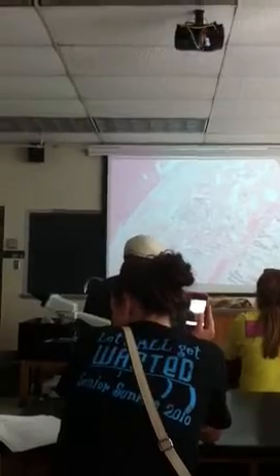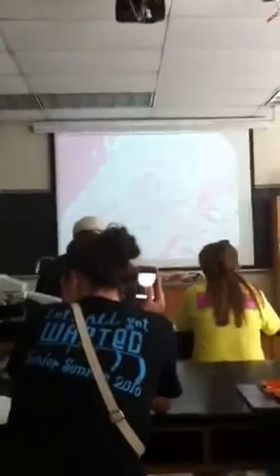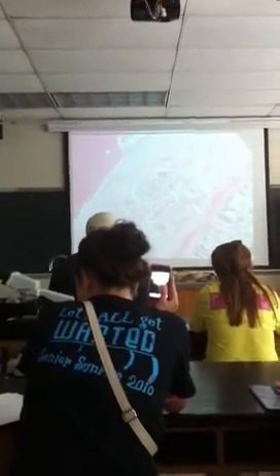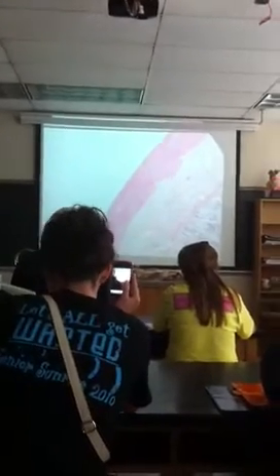So on the test, when we do histology, you can't just tell me small intestine. You're going to have to tell me specifically what part it is: duodenum, jejunum, or ileum. I'm going to let you know how to know those. Now if we go out a little farther, those are Brunner's glands. If you go down on number 4, it says Brunner's glands, and it tells you about the submucosa of the duodenum and what they do.